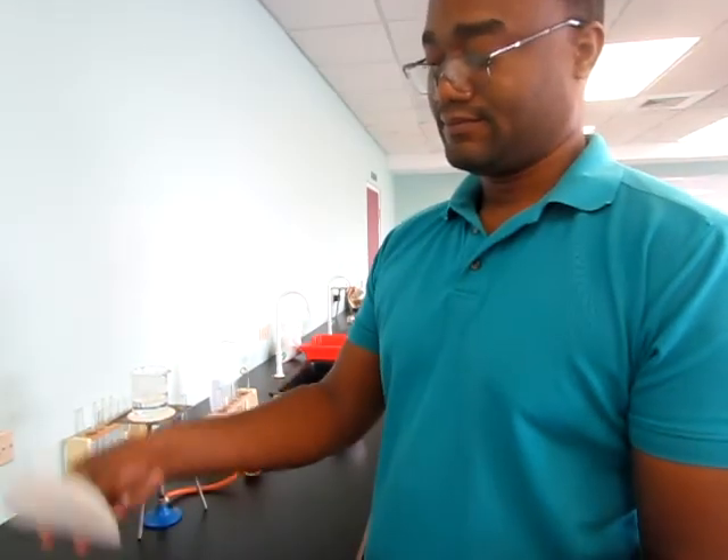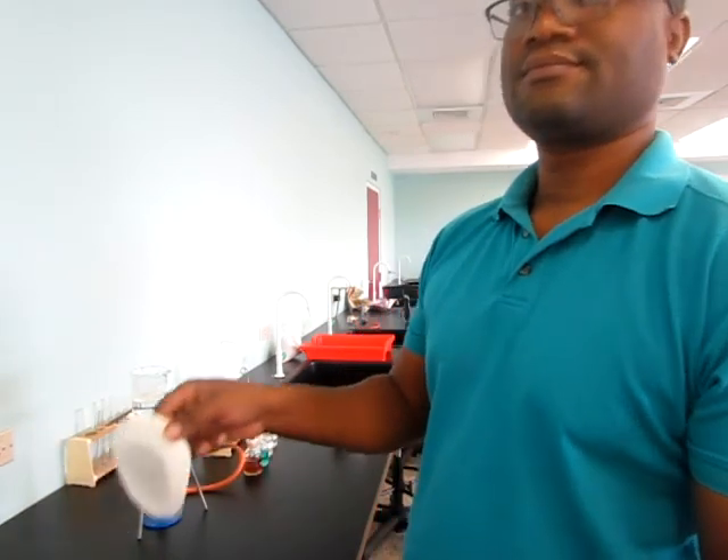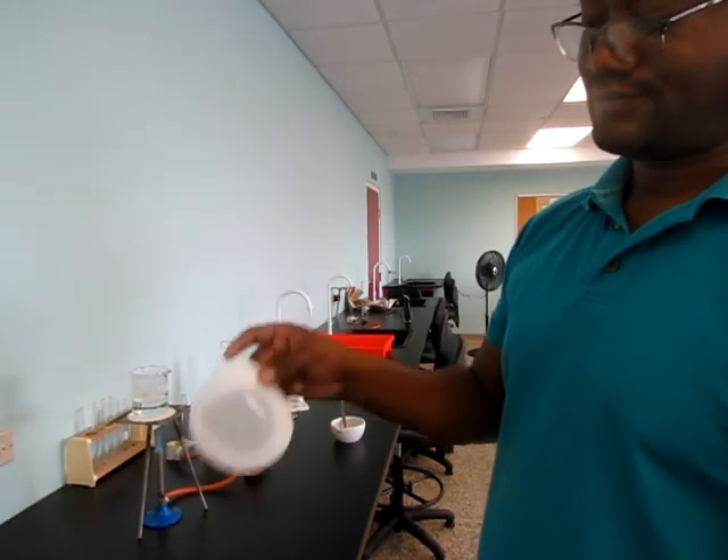We can see that the filter paper is becoming translucent and different from the original, confirming the presence of fat.